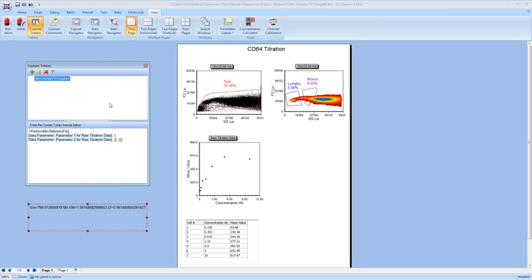You can see here that our first x value is starting at 0.156 and our last is going to 10. So for our overlay, we probably want to create a trend line that maybe starts at 0.1, so it falls a little bit before this 0.156, and let's end it at 12. So that way our trend line overlay will go a little bit further than our highest value.